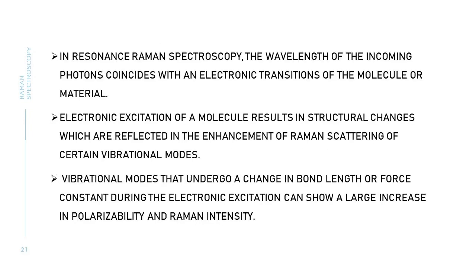Also, basically, in resonance Raman spectroscopy, the wavelength of the incoming photons coincides with the electronic transition of the molecules. This means the electrons in the molecules are excited from one energy level to a higher energy level, and by this electronic excitation of the molecule, there is a change in the structure of the molecule, which is reflected in the enhancement of the Raman scattering because of the vibrational mode.